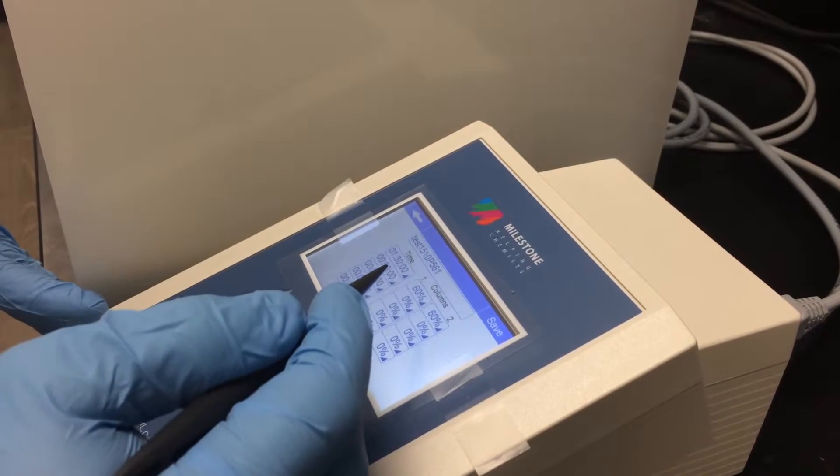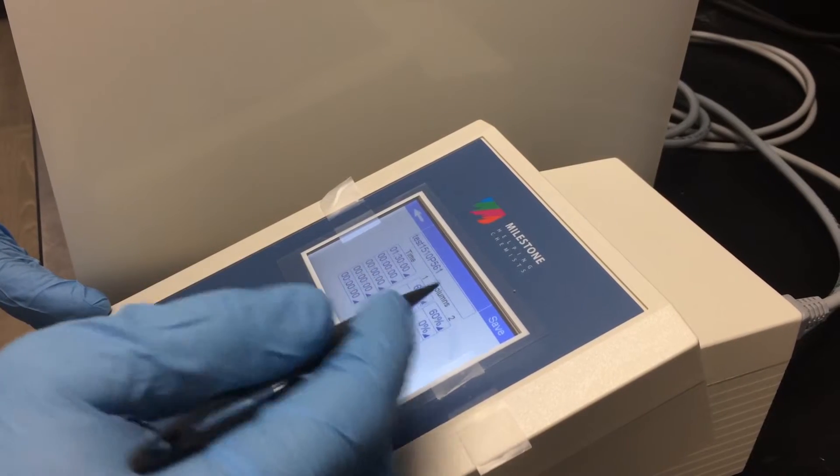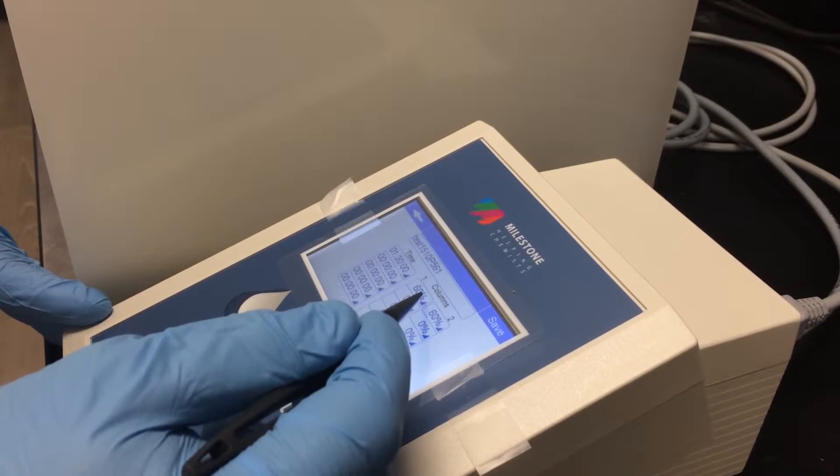Most distillations will require between 50 and 70 percent power. We will change that parameter by selecting this box here.